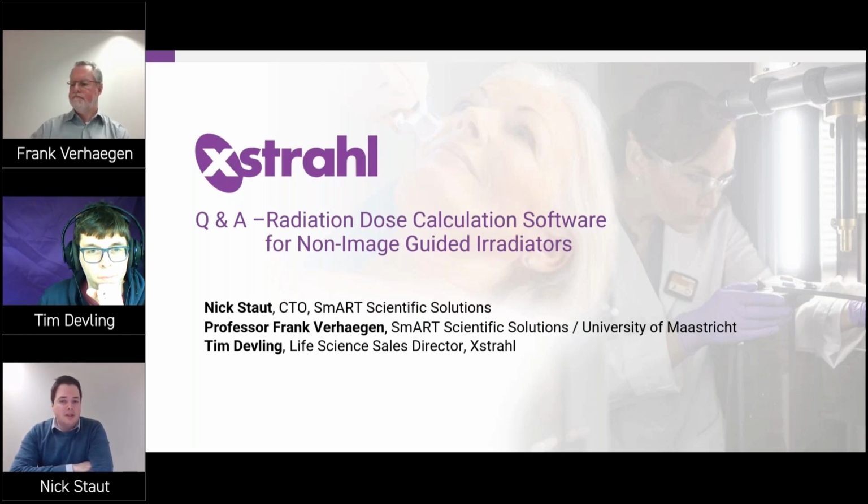But one thing you always have to take into account with Monte Carlo simulations in general is out of field dose calculations, which if you put a shield above the well plate would be the case, is that you need a lot more particles to get good statistics under that shield.